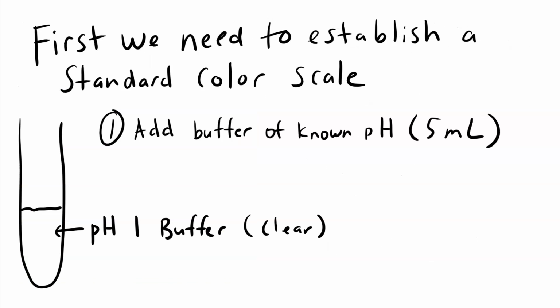Okay, so the first thing that we do is establish a standard color scale. Now I will demo this for you in class. There are also videos online from previous years that show how to do this. So if you're missing class, you can go to that video and watch the process.